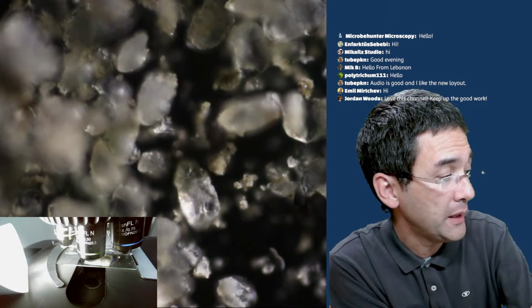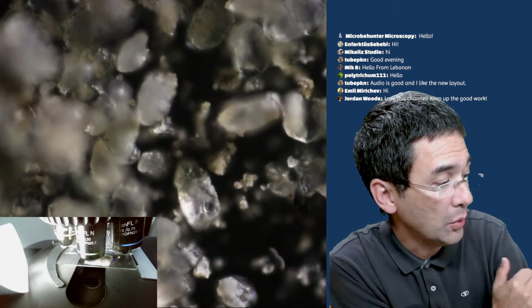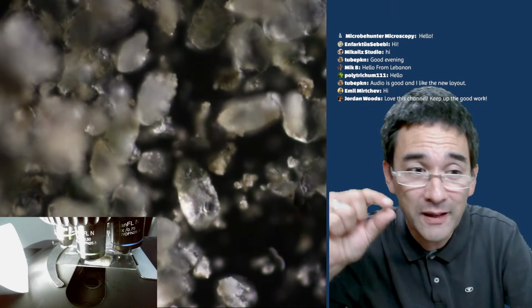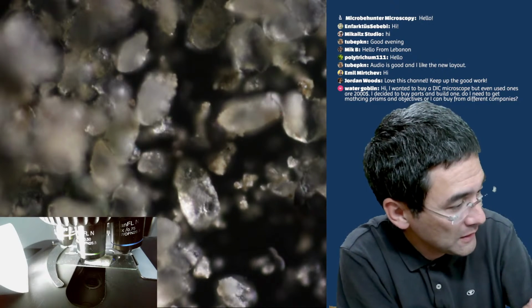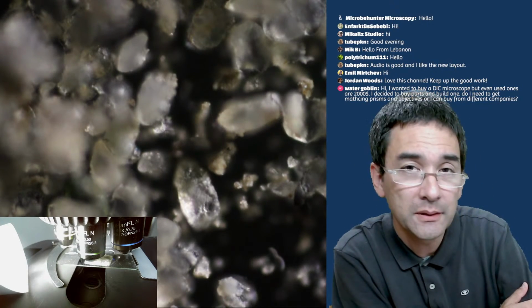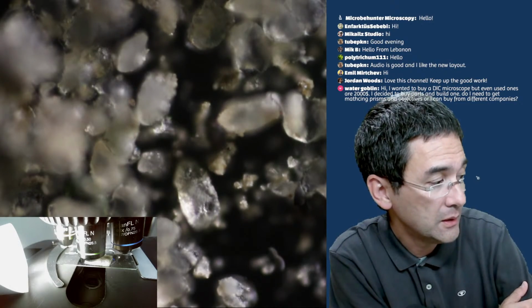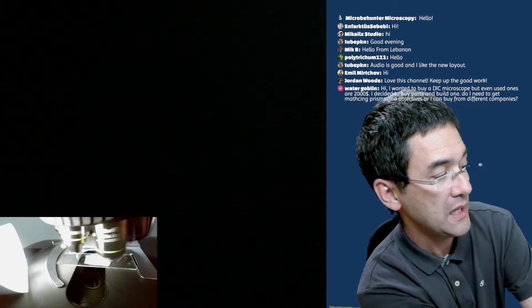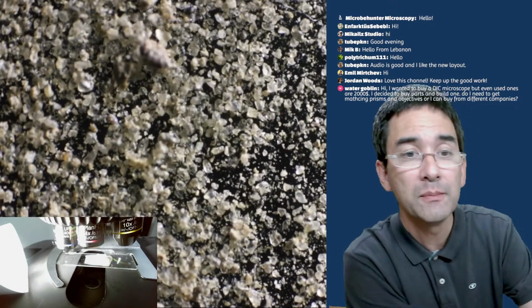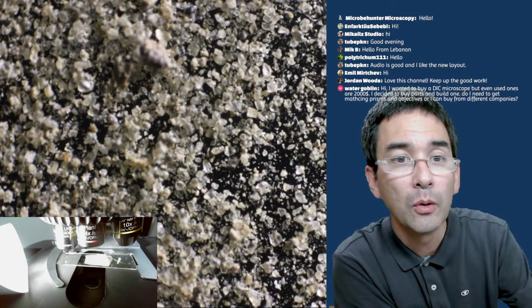Okay. I would not dare to go up yet more, because then the working distance, the distance between the objective and the specimen, is too low, and I might get some of the sand on the objective. I don't want that. But essentially, if you stay with the low powers, I think you'll be fine. So that is the 4 times objective, and we can see that this is actually quite nice.